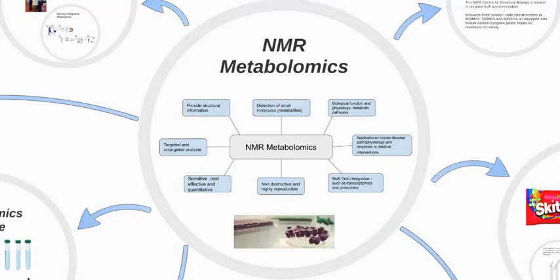This infers physiological function with respect to metabolic pathways, whereby analysis can be targeted or untargeted. It can be used to determine the pathophysiology of disease, response to medical interventions, and much more, while also providing chemical structure analysis. It is regarded as non-destructive, reproducible, and cost-effective.